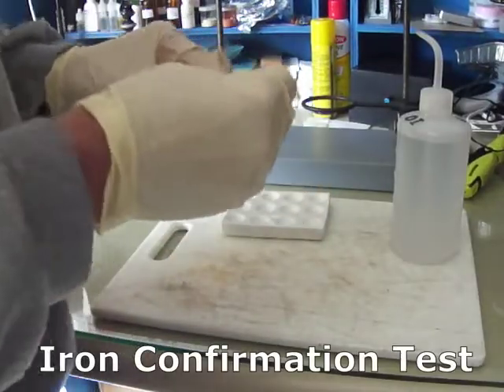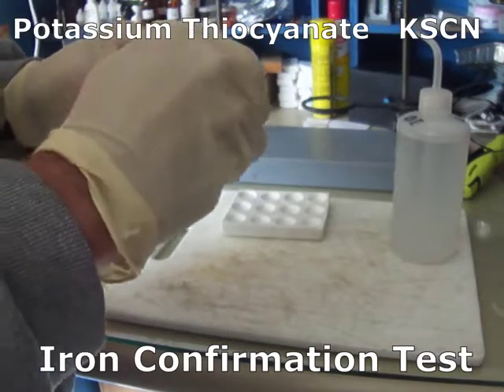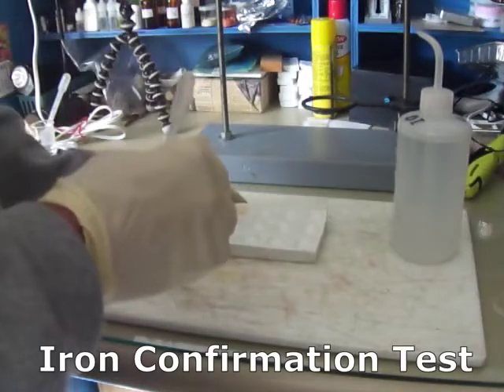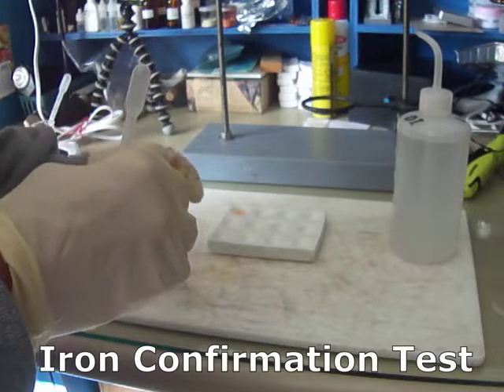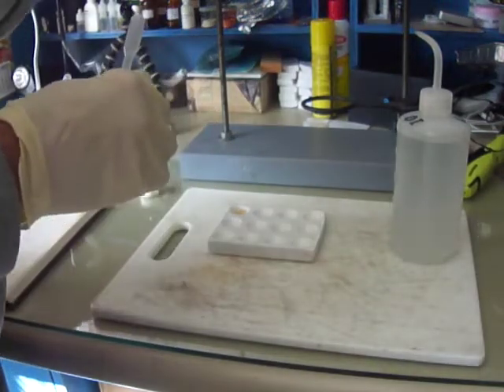Now to some of our solution, we're going to add a drop of potassium thiocyanate. And if there's iron there, it'll turn blood red. Alright, maybe a little bit of a pink color, but definitely not blood red. So I would have to say that the main cation there is not iron.